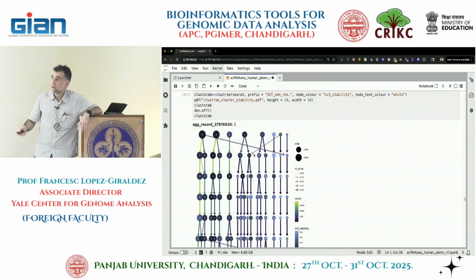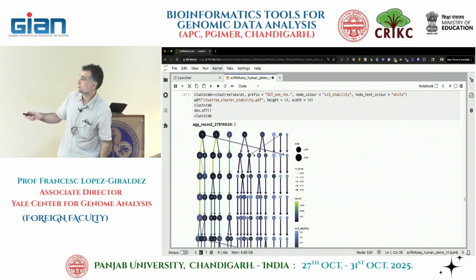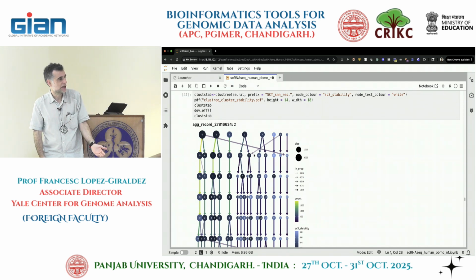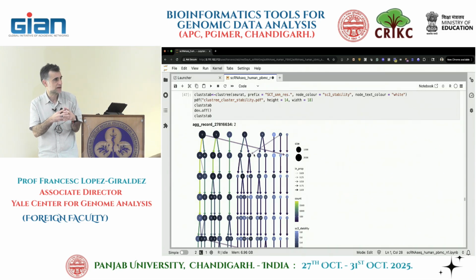So if we want to see how stable a cluster is, let's look at cluster 7 in the last column. It seems that it's stable all the way down. It doesn't change. So that population of cells that were classified 7 initially, with the exception that more cells are coming from 0, at every other resolution it seems to keep that group of cells always together. It's not changing.